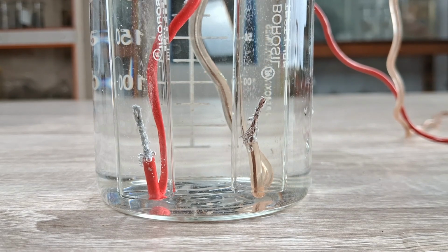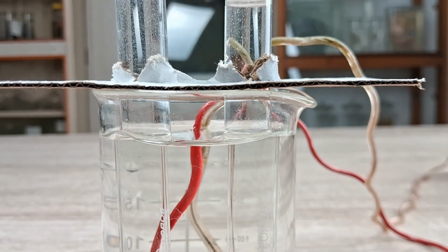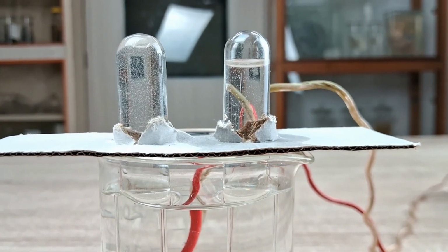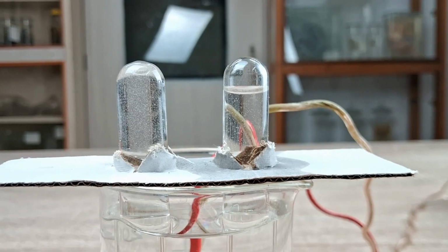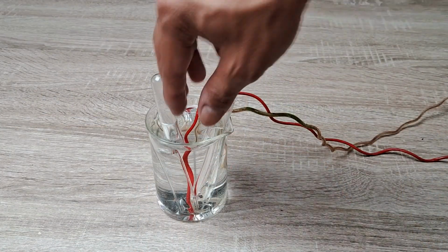If you allow the electric current to pass through the wires long enough, you'll also notice that the gas bubbles begin to collect in the upper ends of the 2 test tubes, and that the volume of gas that collects in the cathode tube is seen to be twice the volume that collects in the anode tube, which you can measure using a ruler. Allow both test tubes to be completely filled with the gases.